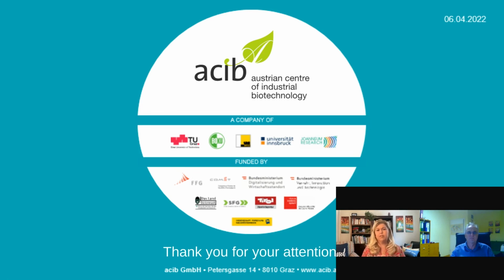Is the fusion protein technology scalable? What I have seen so far, yes, it is scalable. Until recently, the fusion protein technology suffered from the high price of the enzymes for cleavage, if you want to go to a real large-scale operation.